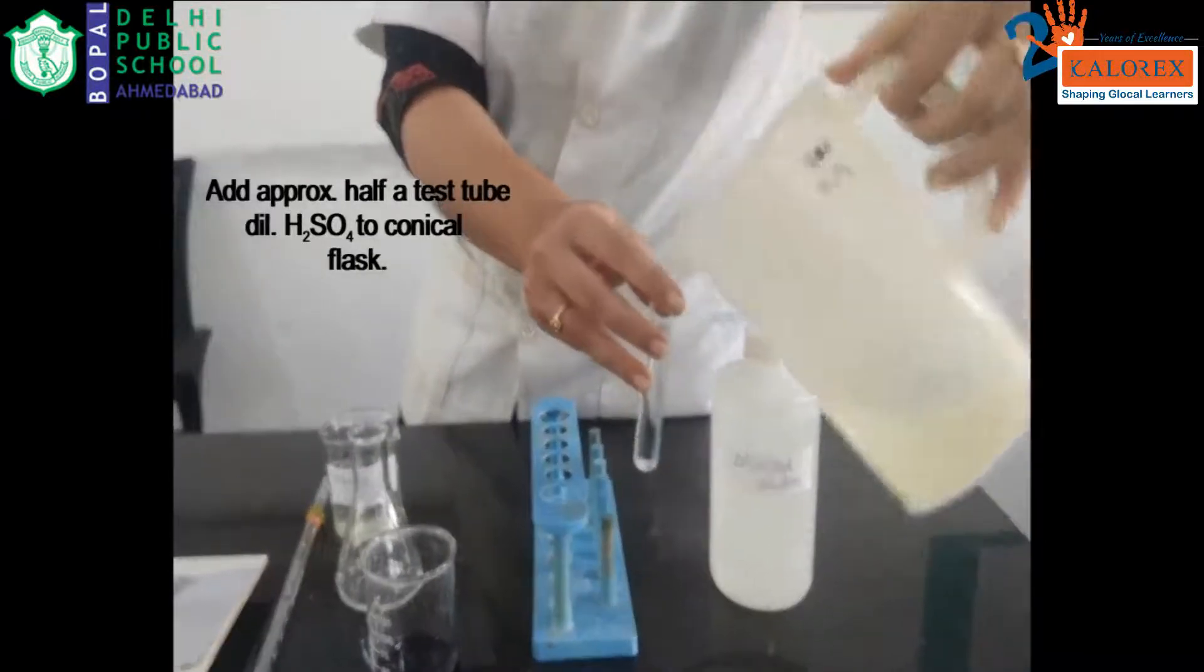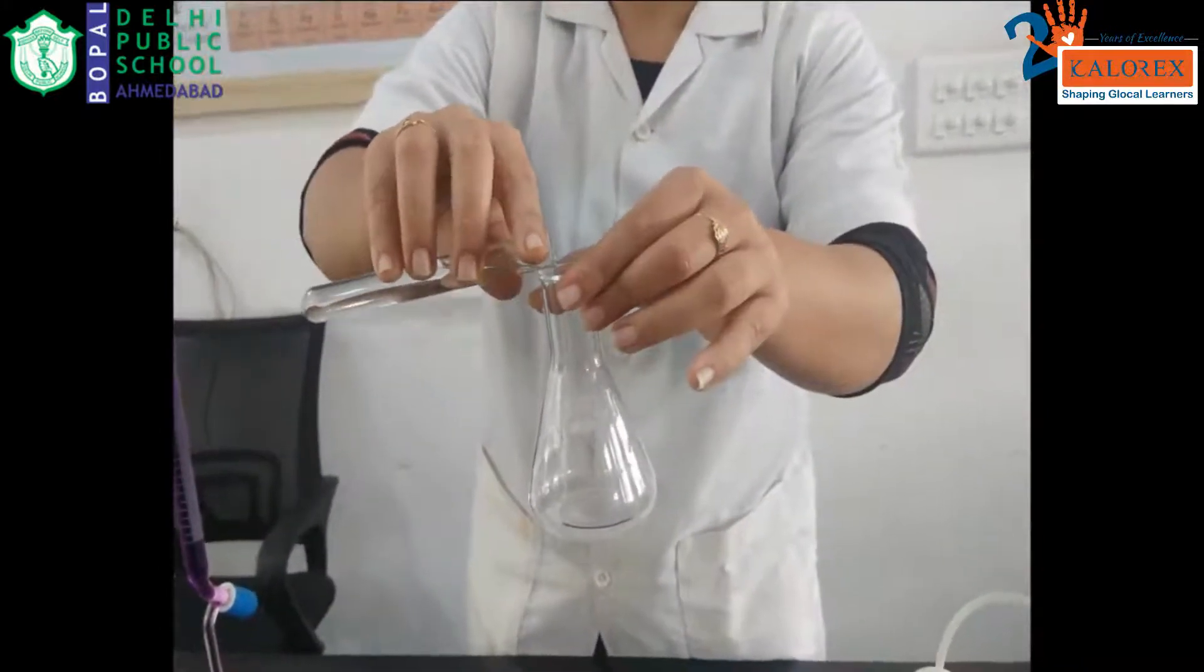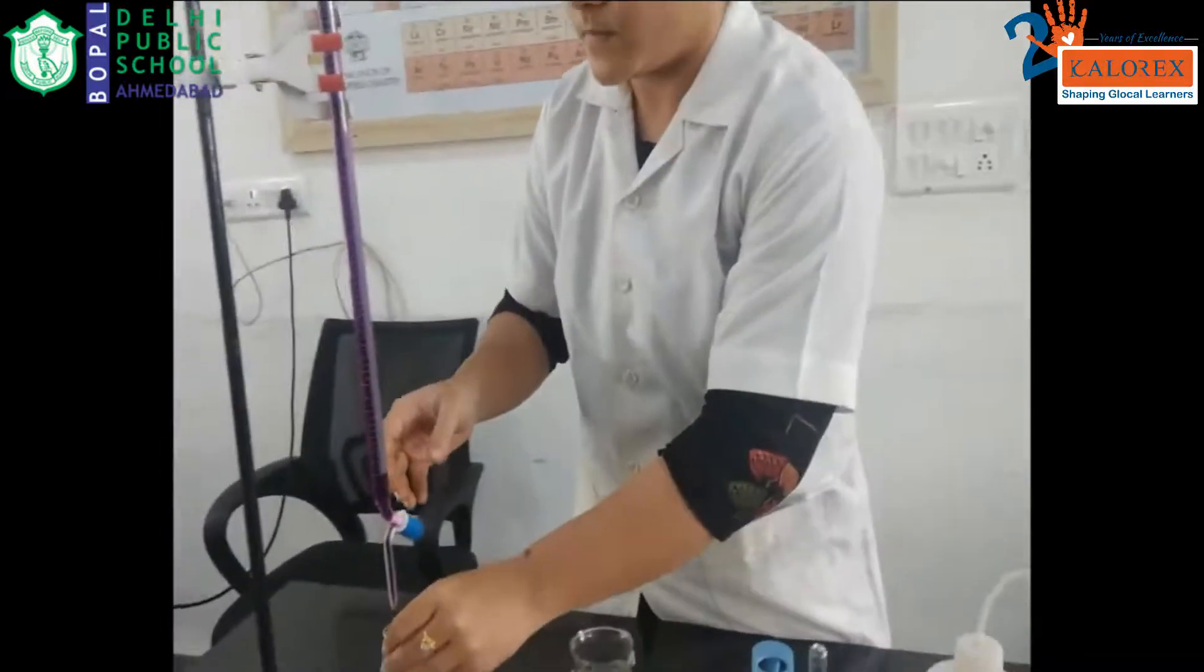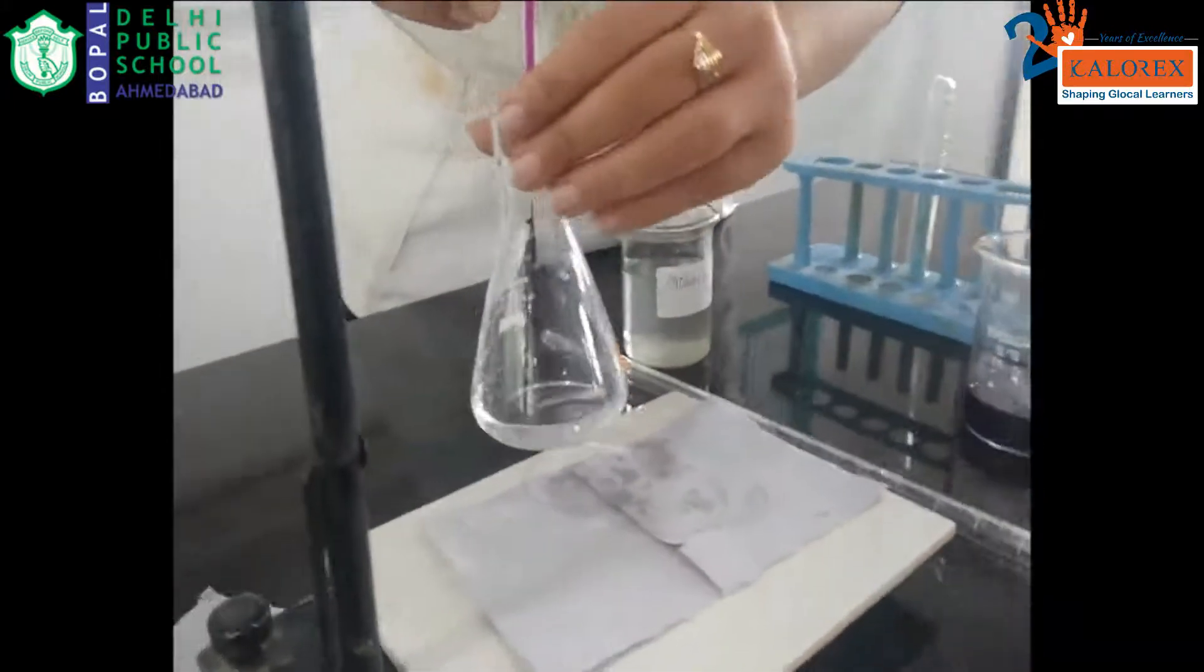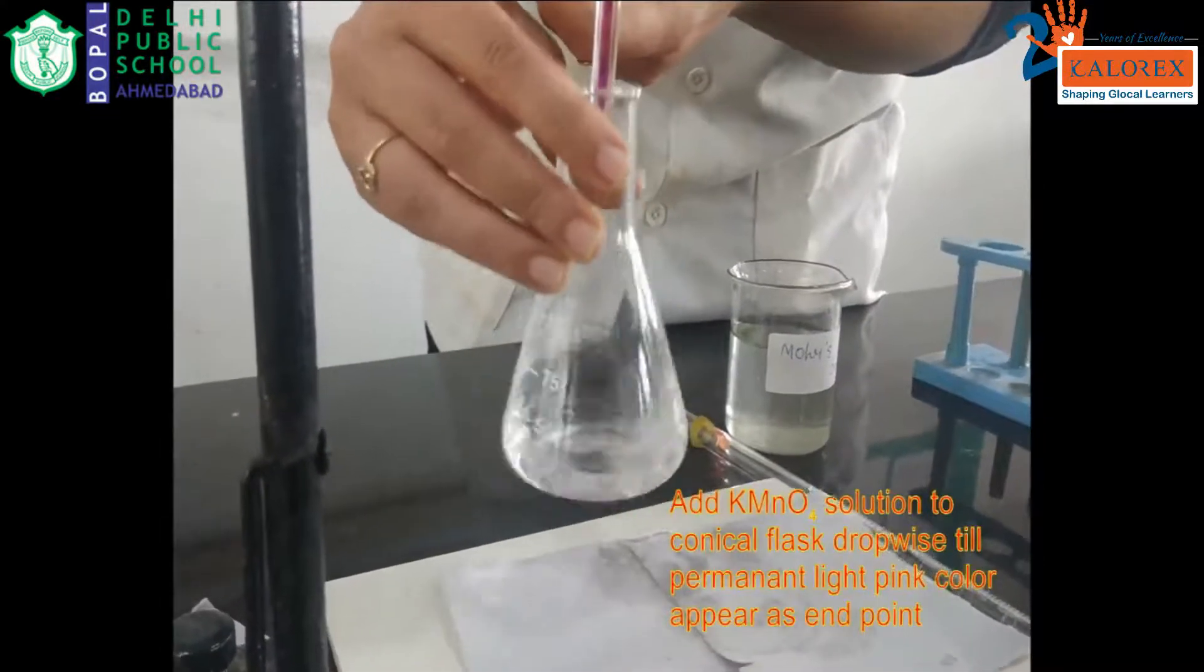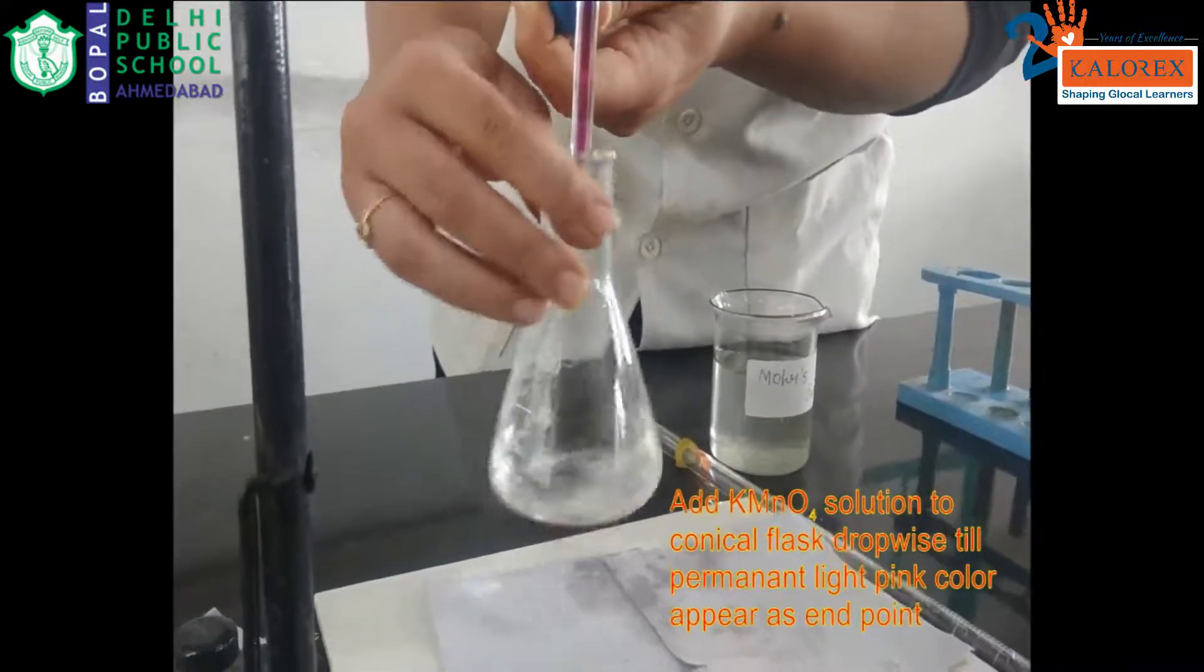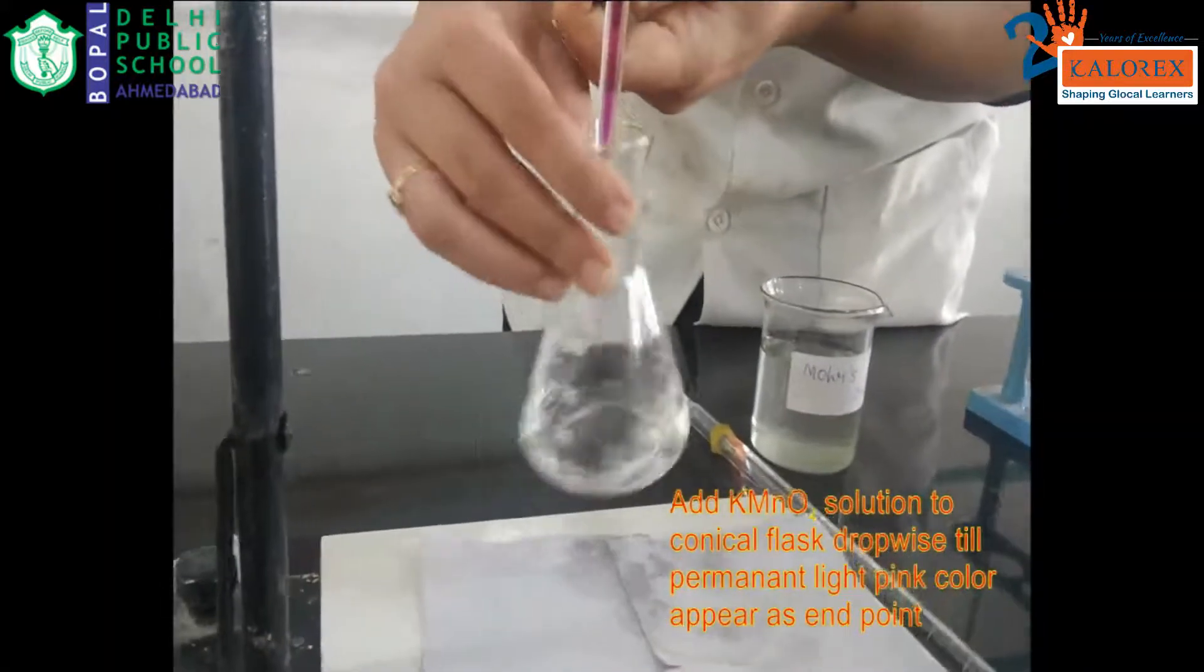As the KMnO4 works as a good oxidizing agent in the acidic medium, here we are using sulfuric acid, dilute sulfuric acid that is approximately little more than half the test tube, and transfer it into the conical flask. Stir the solution well and the solution is ready for the titration. Here the burette is already filled with the KMnO4 at the zero mark. Add KMnO4 drop by drop till we get the permanent pink color as the endpoint for the titration. Ensure constant stirring of the solution.